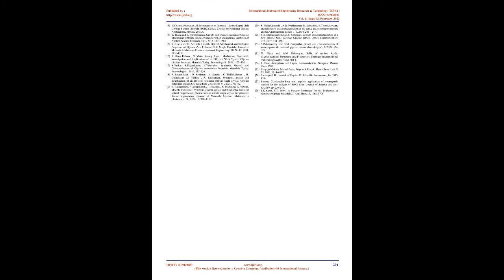barium. The crystalline properties are studied by PXRD, and it is found that the compound crystallizes in the tetragonal system. The FTIR spectrum is used to analyze various functional groups in the compound. The compound shows a wide transparency window, which showcases the nonlinear properties of the compound. The band gap energy and the extinction coefficient of the compound are determined from the UV-Vis spectra. The nonlinear optical properties of the compound are yet to be determined using the Z-scan technique.